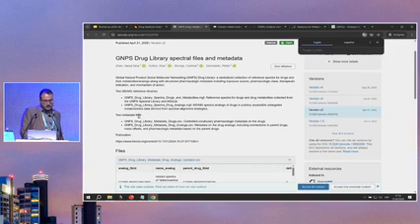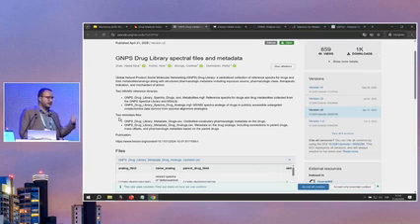We also have the metadata files for that information, so the pharmacological classes, the therapeutic use, annotations, and the information provided from that spectra. It's already in the metadata file. So you just select if you want to use only one of those, or if you want to combine with your own internal library when you're doing the job, you can just add those libraries to your job and then run it.